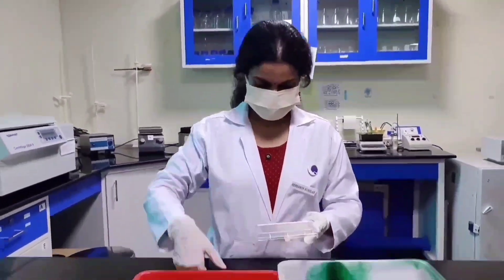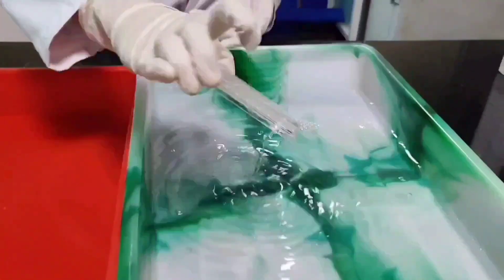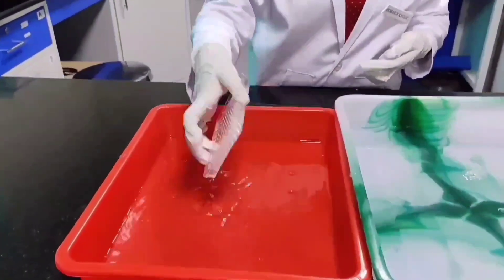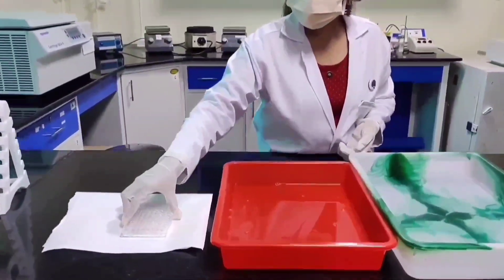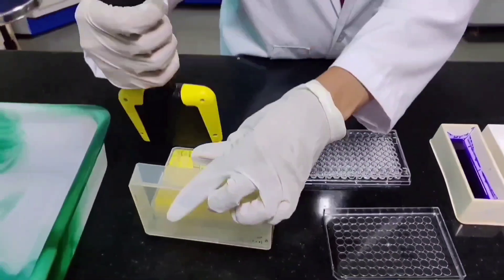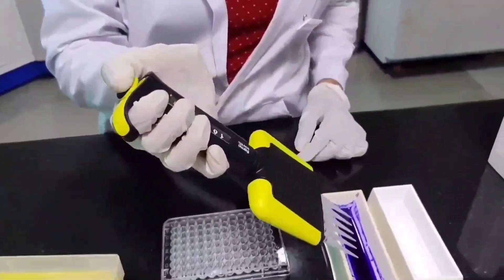The following day, the plate is processed to quantitatively assess the biofilm formation. The planktonic cells are discarded and washed in water. The plate is dried using blotting paper, followed by addition of crystal violet stain and incubated for 15 to 20 minutes.